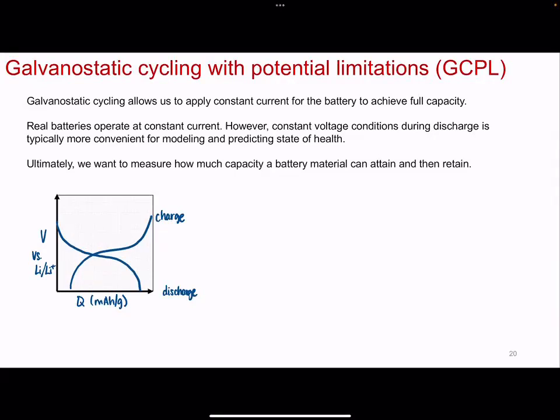And this is quite evident when you work in, let's say, lithium sulfur batteries. You see overcharging quite a bit because there's polysulfide shuttling, there's decomposition of the active material, there's all of that. That is not real, and when I say that, I don't mean you don't see it, I mean it's not related to the active material that you were initially interested in. It's indicative that there are some other secondary processes going on.